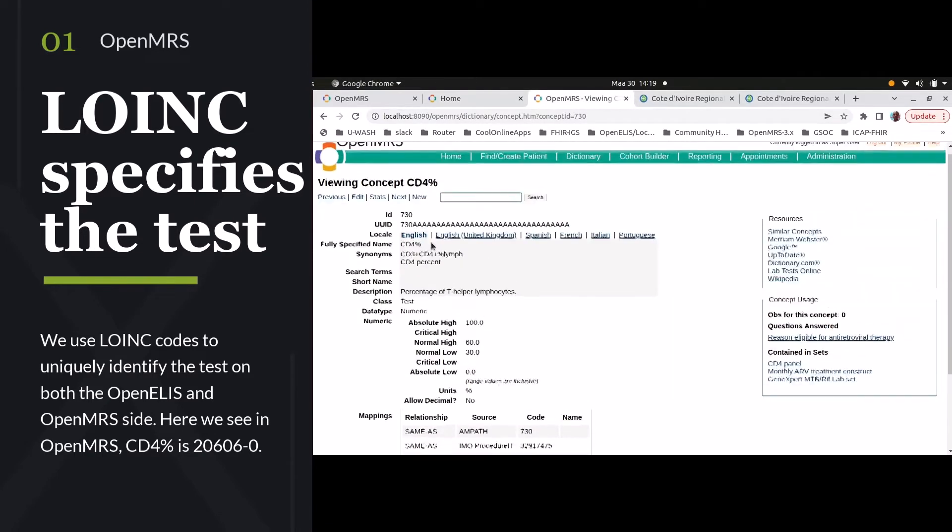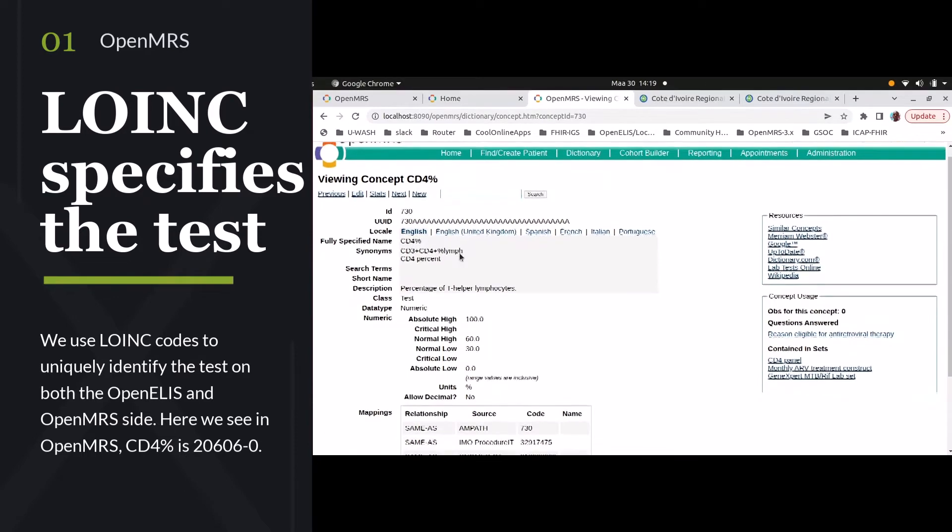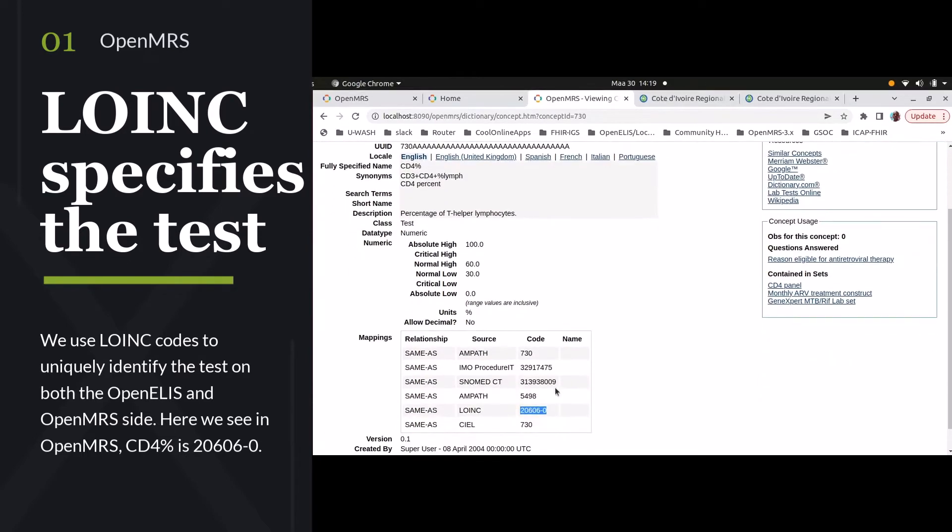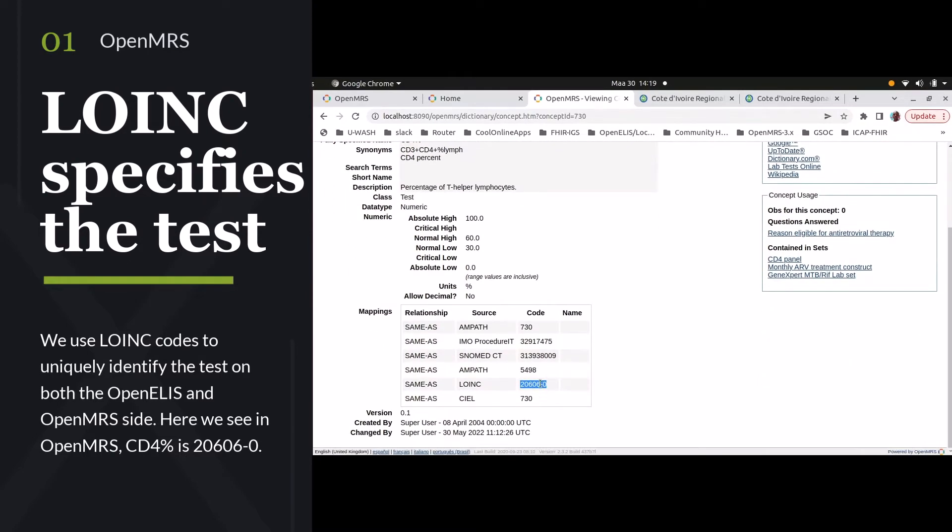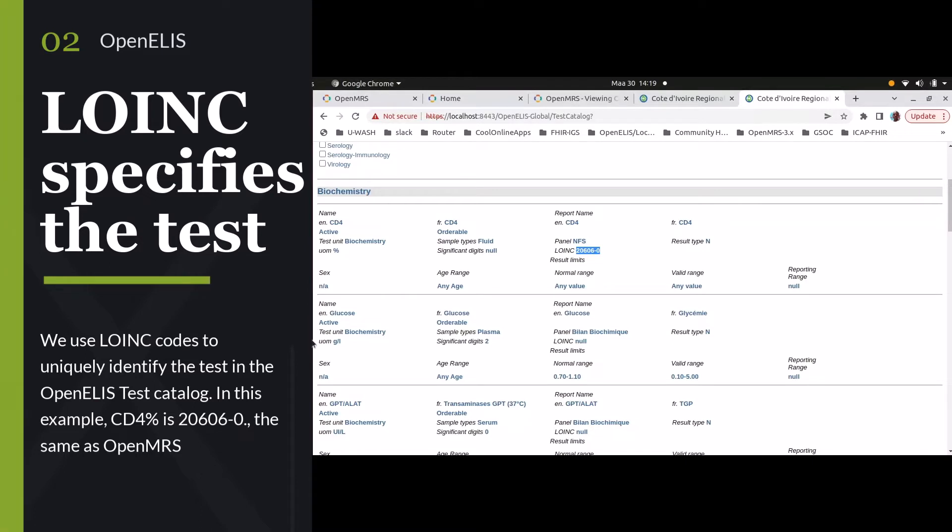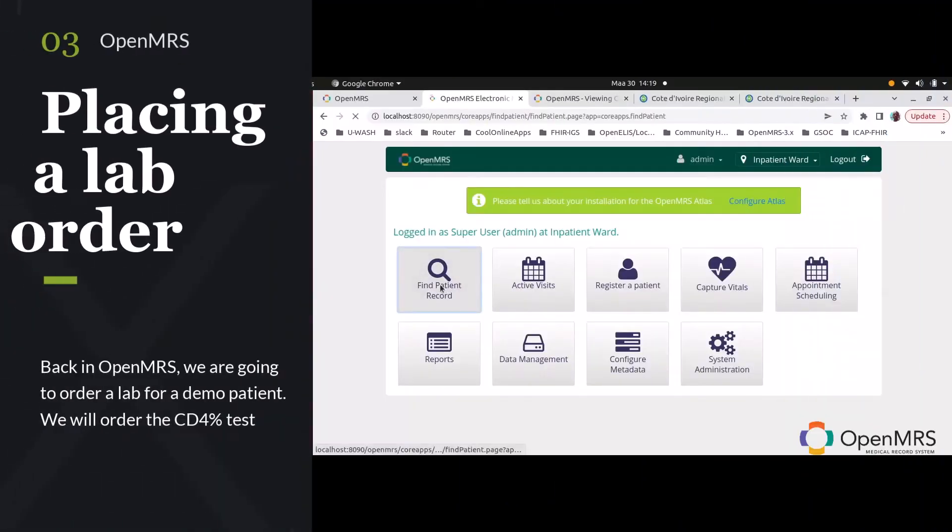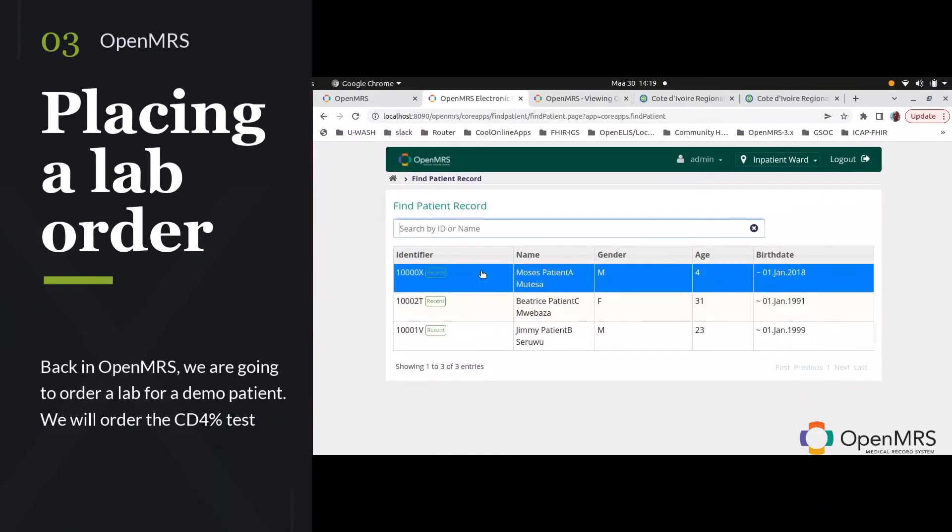On both the OpenMRS and OpenELIS sides, we are using LOINC codes to uniquely identify each of the tests that we're ordering. In this case, we're using a CD4% count, which is LOINC 20606-0 on both the OpenELIS and OpenMRS side.